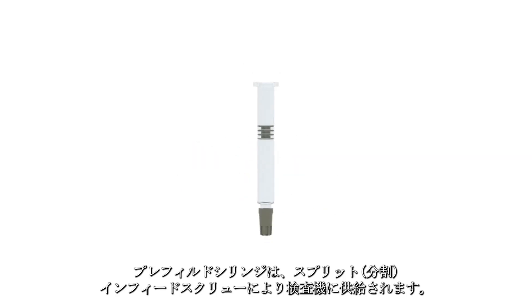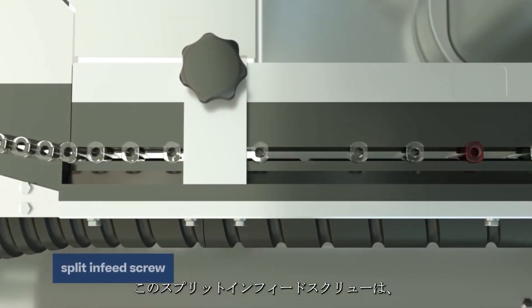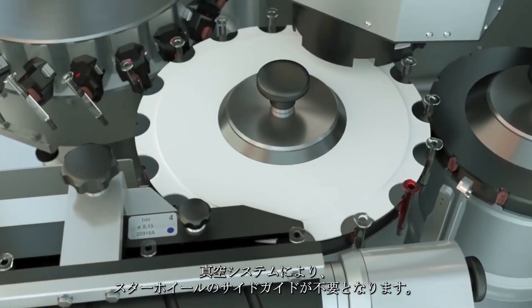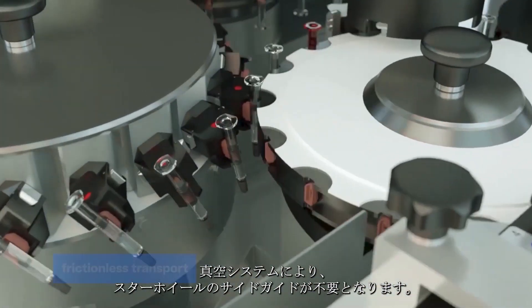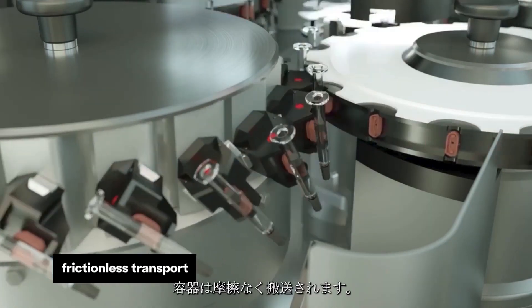Pre-filled syringes are fed into the inspection machine through a split-in feed screw. The split-in feed screw enables controlled emptying at a predefined speed. A vacuum system makes lateral guides at the star wheels obsolete, and containers are conveyed without friction.